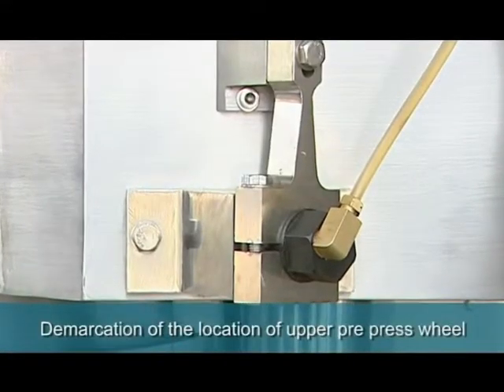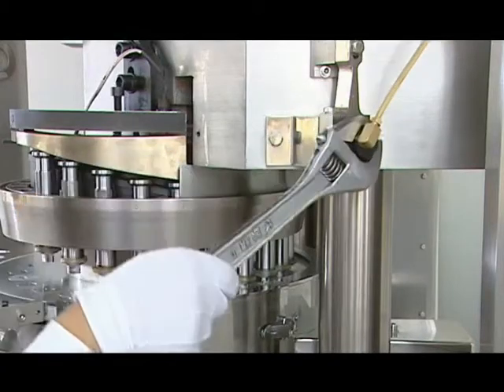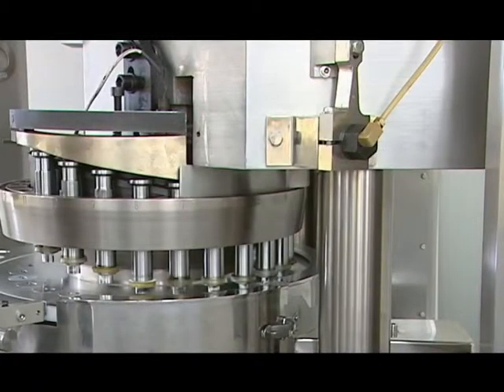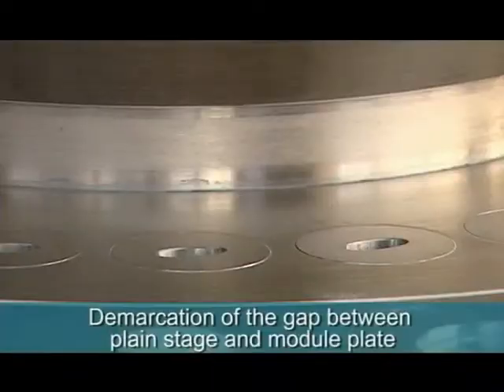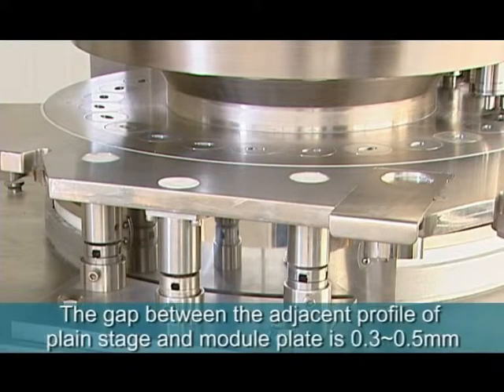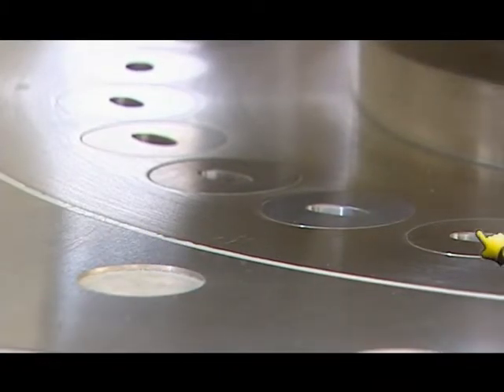3. Demarcation of the location of the upper pre-press wheel. Adjust the upper eccentric shaft so that when the upper module is right under the upper pre-press wheel, it enters into the module 2 mm. 4. Demarcation of the gap between plane stage and module plate. The gap between the adjacent profile of a plane stage and module plate is 0.3 to 0.5 mm.